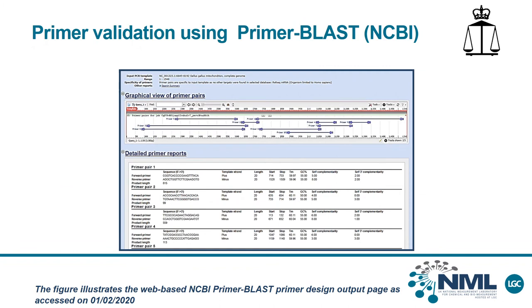An example of the typical output for a Primer BLAST primer design evaluation is shown on the slide. The output is described in detail in the e-seminar, An Introduction to Designing Quantitative Real-Time PCR Assays, which is available from the Knowledge Resources section of the website www.gov.uk/governmentchemist. However, in this instance, your attention is directed to the highlighted text boxes.